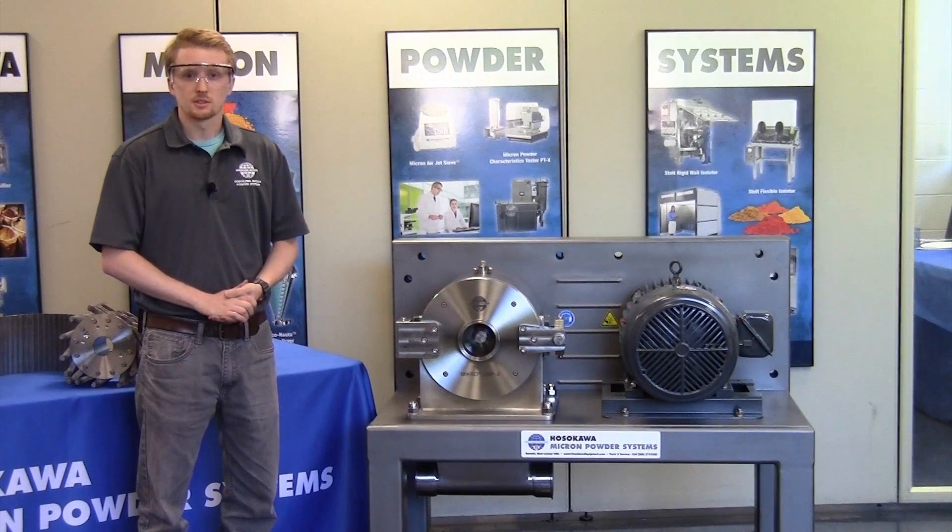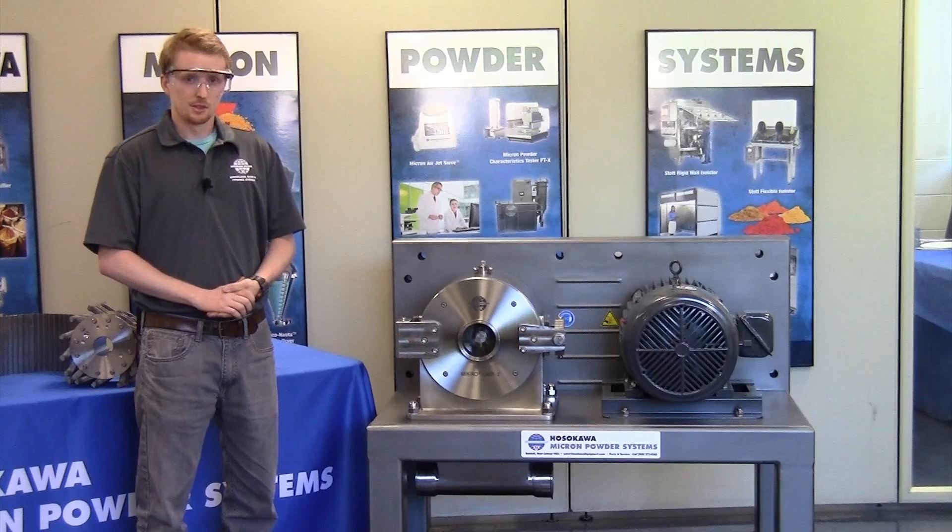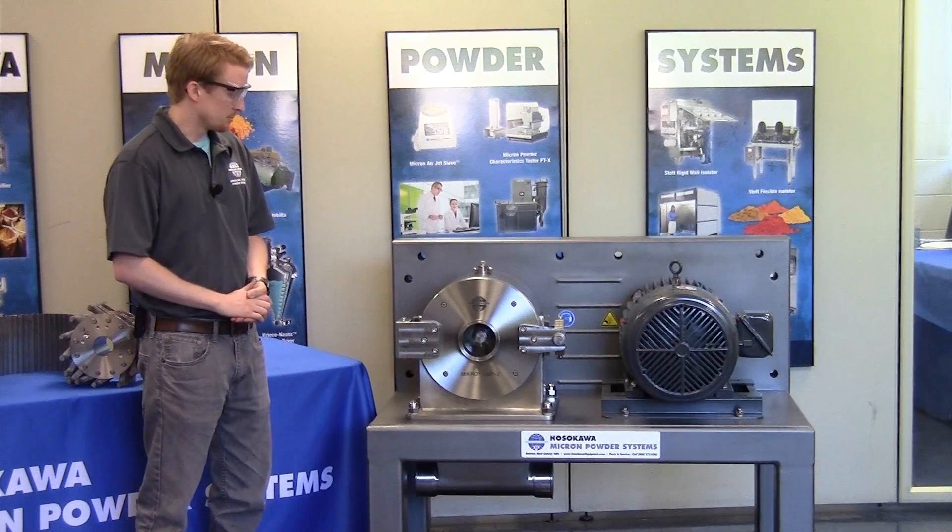My name is Max Ensley. I'm a product design engineer here at Hosekow Micron Powder Systems in Summit, New Jersey. I'm here today to help introduce the Micro UMP2.